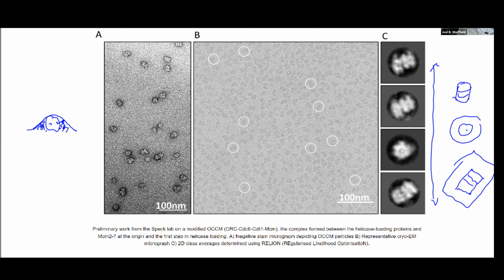Okay. Well, if I'm going to sit here and do this, I'm doing it forever, picking out one molecule at a time, straining myself to see if I can actually see what's going on. And actually here I can see a pretty good example of one of those molecules sitting on its side. But most of them would really be a problem for me to go and sit and pick them out and then align them. So I would take all the ones that are on the side and kind of stack them up and then look at what's the common features in all of them.